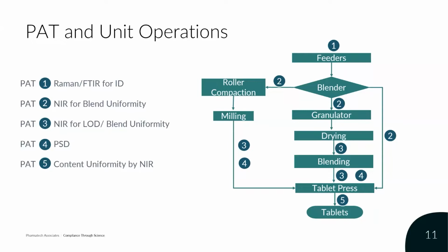Often, in just the batch manufacturing process, determining blend uniformity, which is a critical component for your process validation, can be problematic to do manually because the physical act of collecting samples for analysis can result in either segregation or desegregation of the blend at the point that you're actually doing the sampling. Usually these local effects can be produced just by the introduction of a sampling thief. And you can eliminate this sort of issue if you use process analytical technology during the blending process.